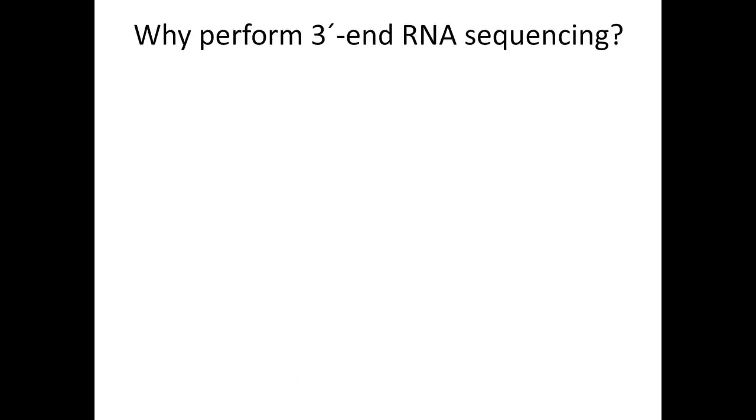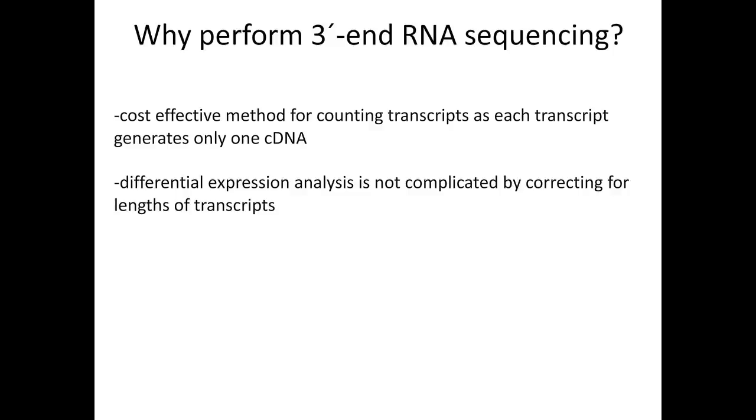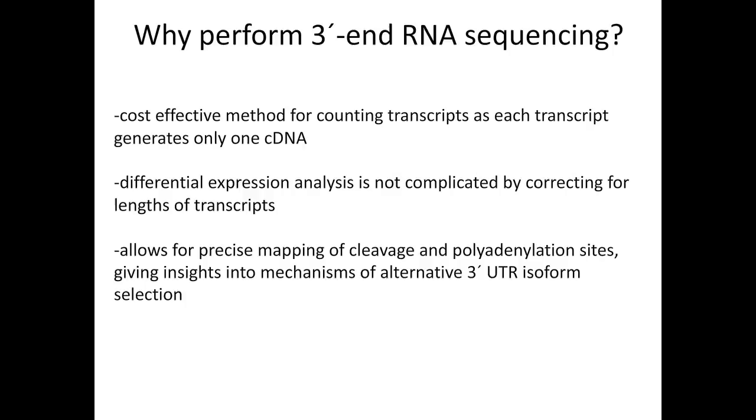So why would we want to perform 3' end sequencing as opposed to whole transcript sequencing? Well, 3' end sequencing is cost effective and efficient because it counts only the ends of the transcripts, and only one cDNA is generated per transcript. In addition, differential expression analysis, so determining how the expression level of different transcripts in a sample has changed, is simpler for 3' end sequencing because it's not complicated by the length of the transcript and the variation in detection across the transcript. Furthermore, 3' sequencing allows for the precise mapping of cleavage and polyadenylation sites, giving insights into the mechanisms that generate the alternative 3' untranslated region selection.